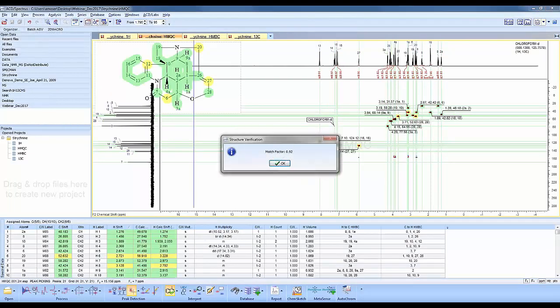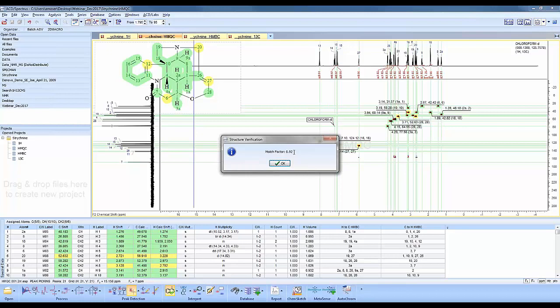The match factor is a value between 0 and 1. The closer to 1, the more consistent the data is with the proposed structure. Here we have a match factor of 0.92.